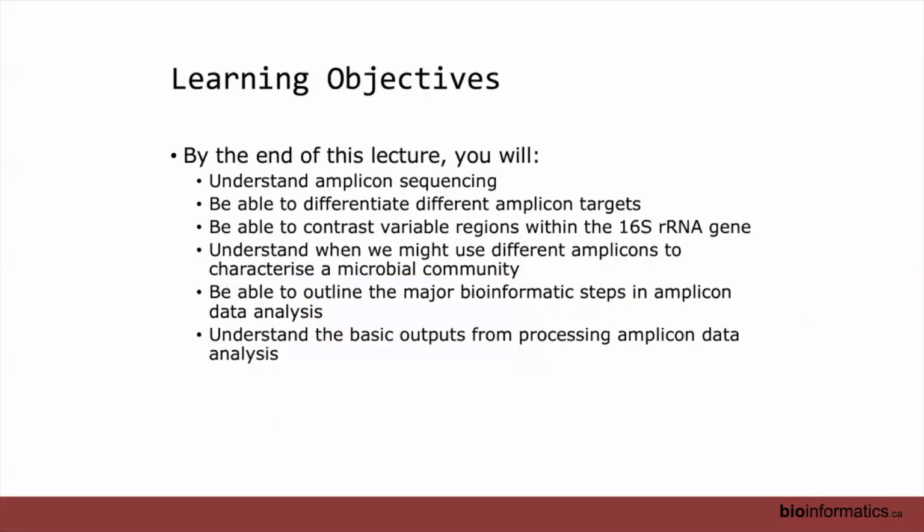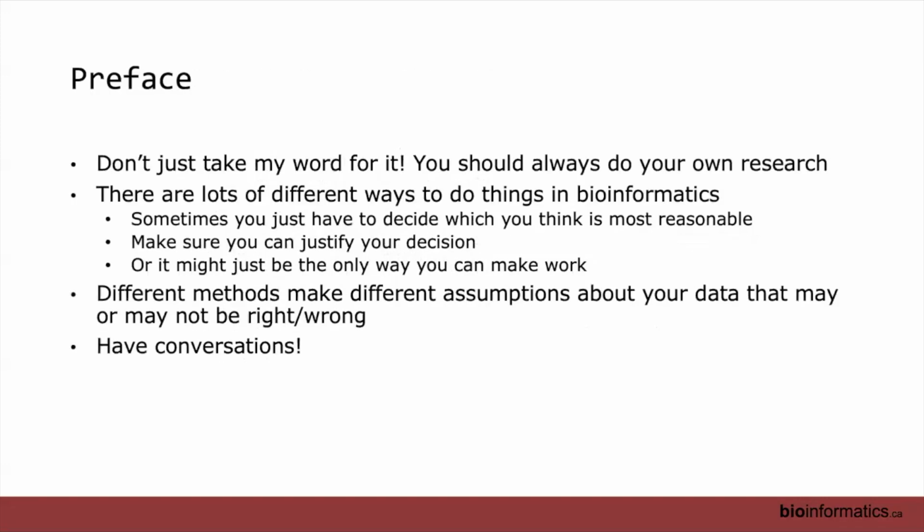So with that, in this lecture, we're hoping that by the end, you will understand amplicon sequencing, be able to differentiate different amplicon targets, be able to contrast variable regions within particularly the 16S rRNA gene, but also some of the other genes. Hopefully you'll understand when we might use different amplicons to characterize a microbial community. You'll be able to outline the major bioinformatics steps in amplicon data analysis and understand the basic outputs from processing amplicon data.